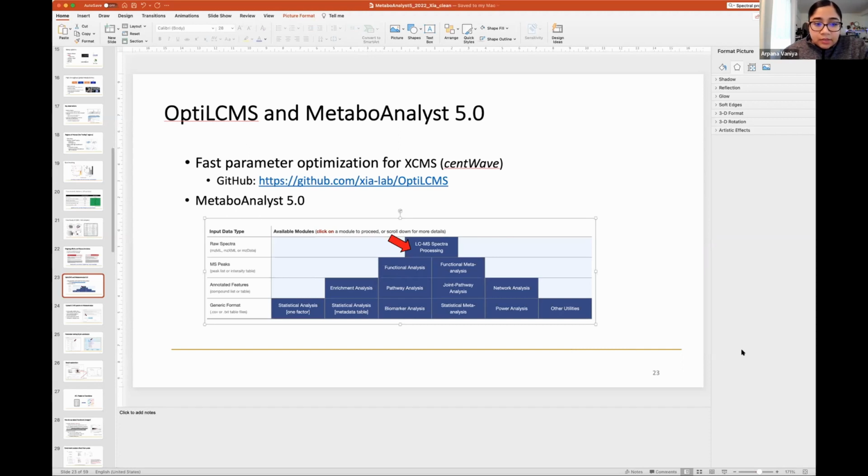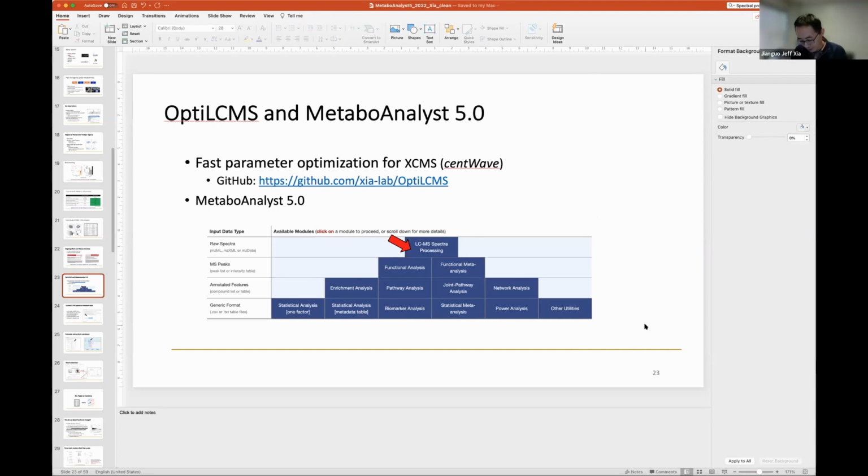Do you have plans to provide MetaboAnalyst tools for QC to evaluate study or data quality, such as pooled QC results, blank results, dilution series results, really anything to evaluate a data set in a way that you have visual aids such as networks and PCAs and things like that?